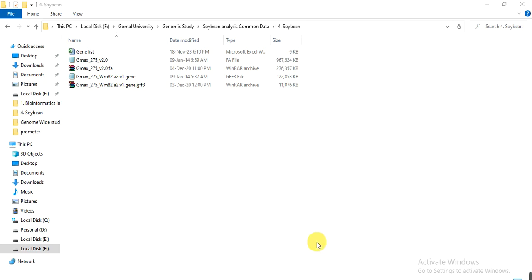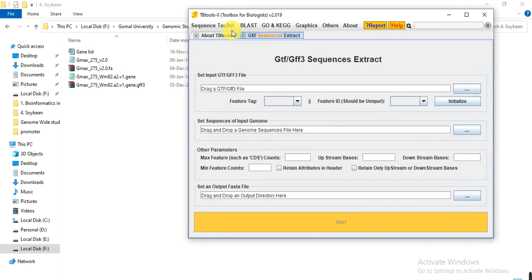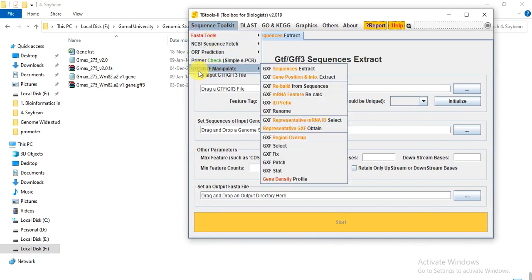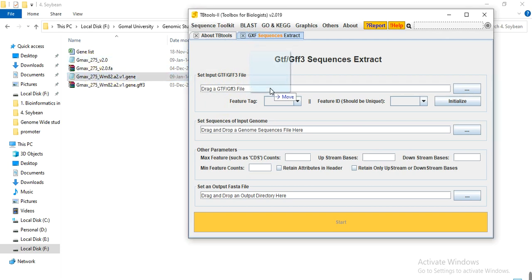To do this, open the TB Tool, go to Sequence Toolkit, then GFF3/GTF Manipulate, and then GXF Sequence Extract. Here you can drag and drop the GFF file into the interface.